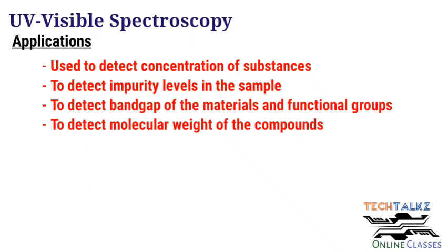Now we can see the applications. Mainly it is used to detect the concentration of a substance, to detect impurity levels, to detect band gap and different functional groups. It is also used to determine the molecular weight of compounds.